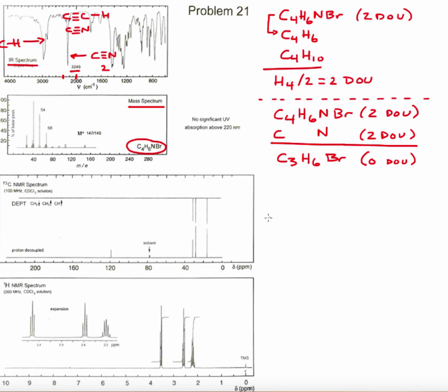Now we can go to the carbon-13 and proton NMR data and start putting the pieces together. In the carbon-13 NMR, let's look at this proton decoupled. That's telling us the number of unique carbons. We see one, two, three, and solvent around 80 which we'll ignore, and then four. We have four unique carbons and the molecular formula has four carbons. This molecule has no symmetry which would reduce the number of unique carbons.